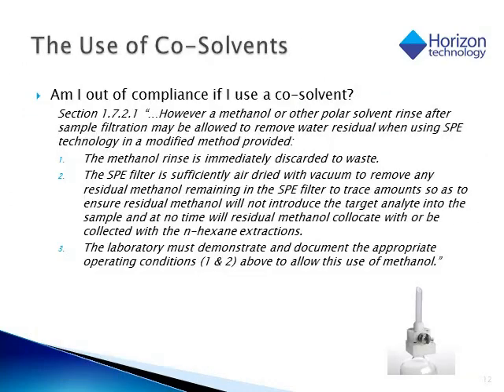So to come back around to the question of compliance with co-solvents, the answer is that you're only out of compliance if you're using the co-solvent as an extraction solvent, meaning you let the co-solvent go into the final extract. If you use the co-solvent as a wash step and simply send it to waste, that's fine. The caveat, though, is that the individual lab has to prove that there is no co-solvent left on the disc to interfere with the results.